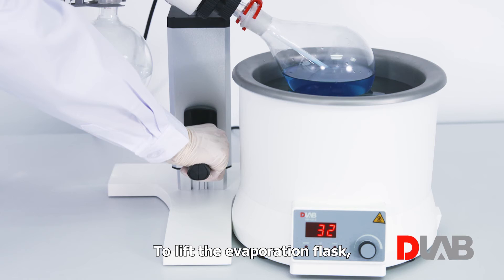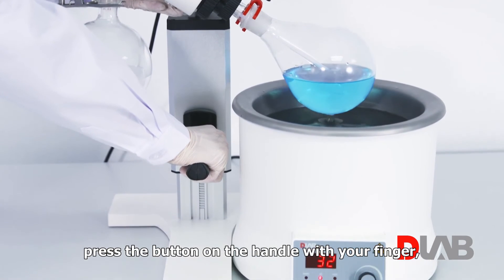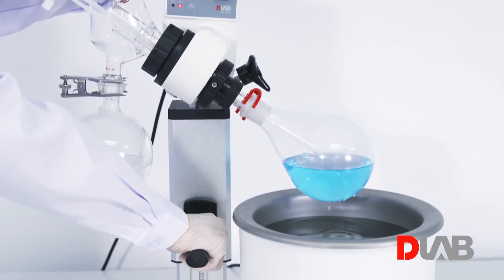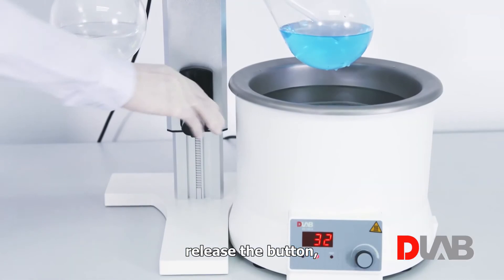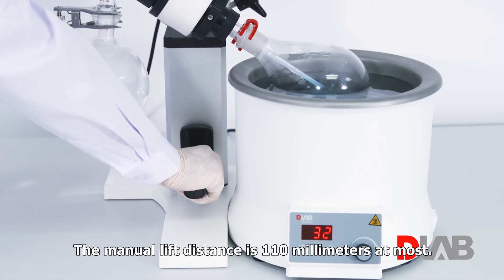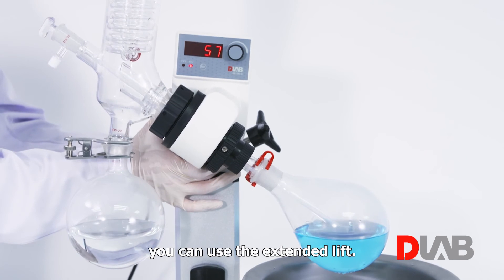To lift the evaporation flask, grip the handle with the right hand and hold the main body with the left hand. Press the button on the handle with your finger and gently lift or lower the assembly to the proper position, then release the button. Ensure the assembly holds firmly before removing your hands. The manual lift distance is 110 mm at most. If that is not enough, you can use the extended lift.